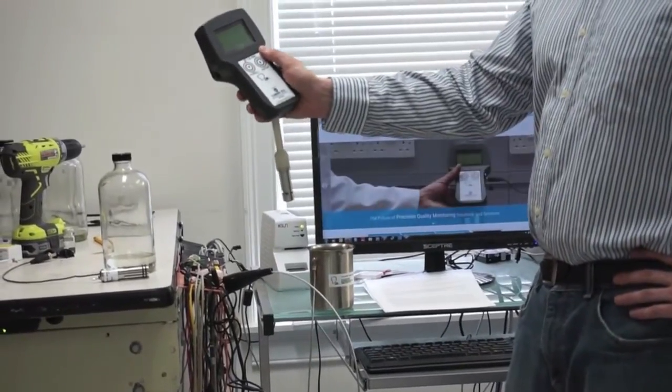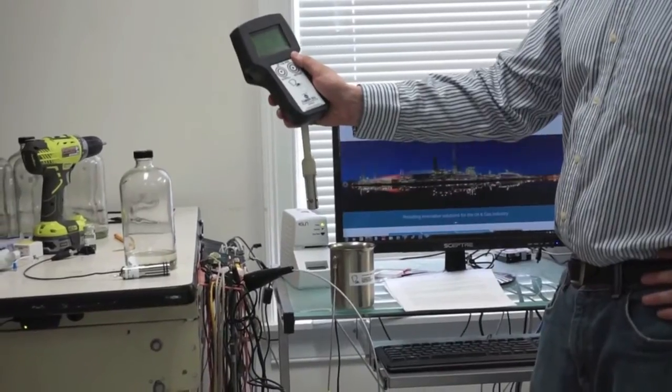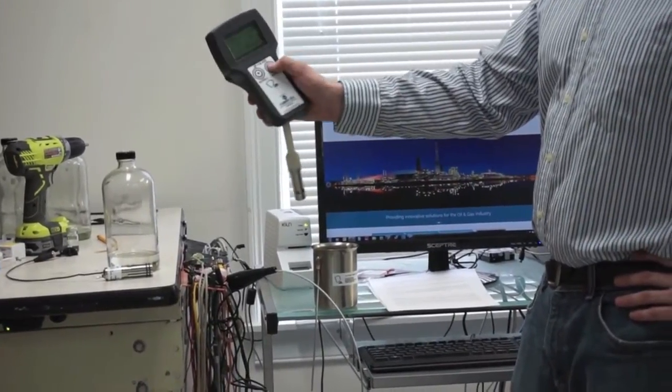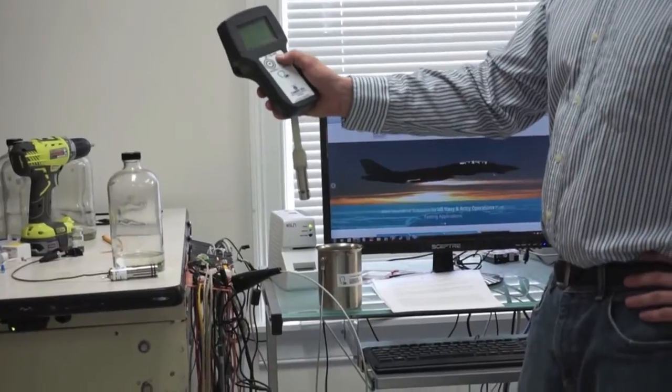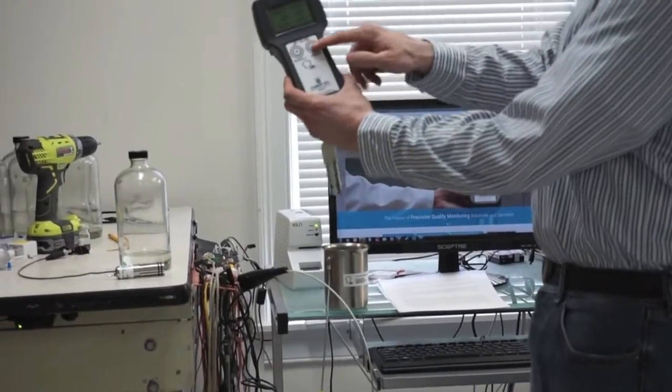Then you get to the main menu and you can either scroll to display previous values you've stored in the device, or hit the enter button to enter into the sample. The device is very simple, it only has two buttons.